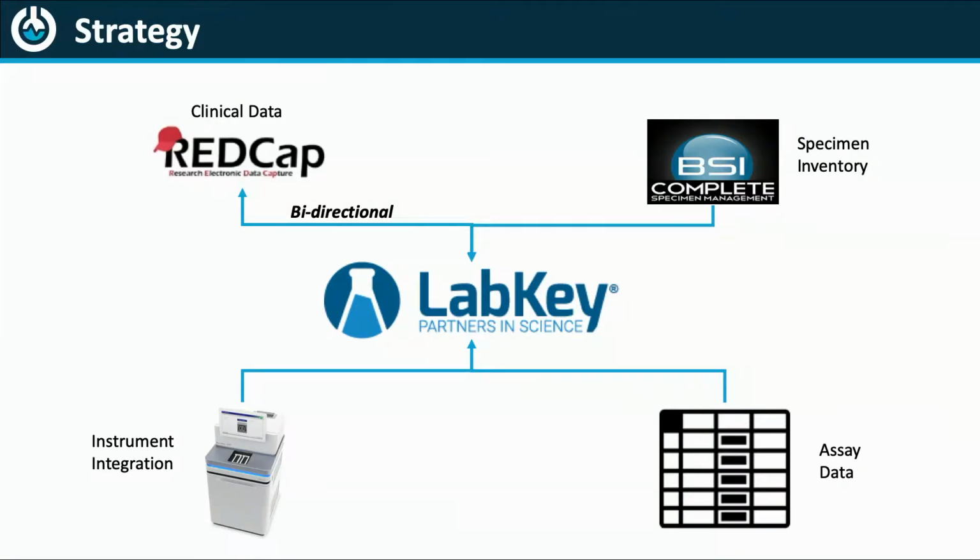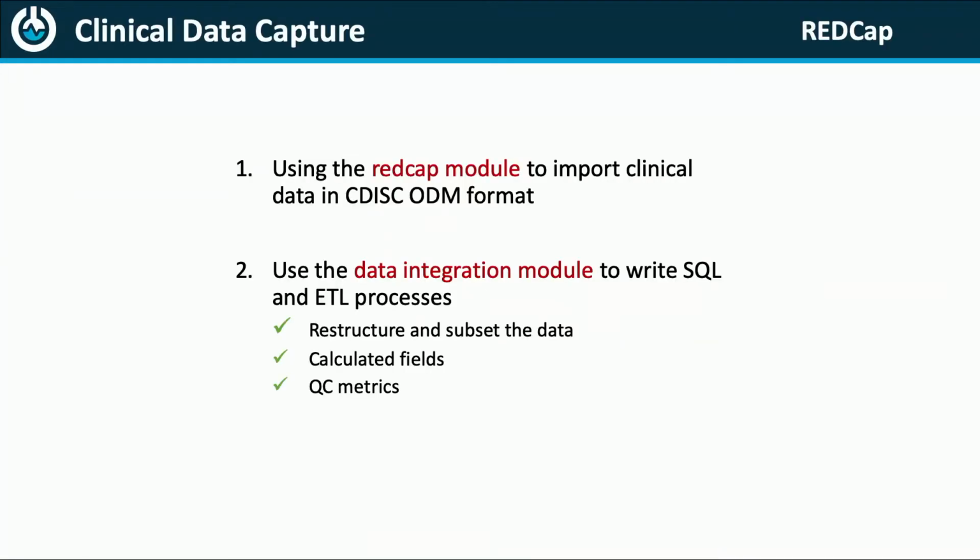So the clinical coordinators are doing data entry in REDCap. The labs are actually doing biospecimen management in BSI. And then we have the outputs of doing the science, right? You have DNA sequencing and you have other kinds of assay data. So in REDCap, I'm going to highlight the technical tools we use that are in LabKey already or that we are going to write ourselves, and how we use them.